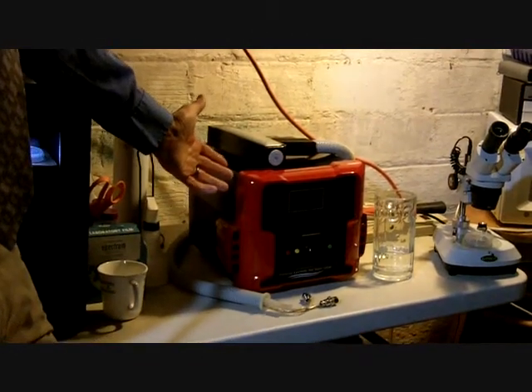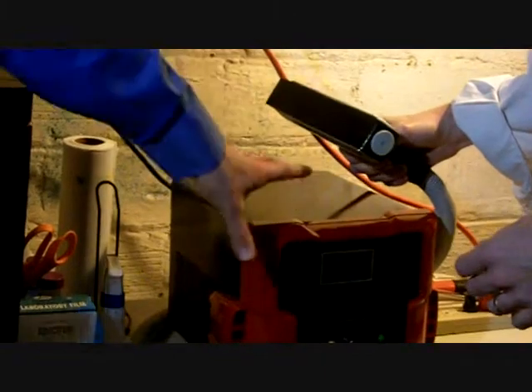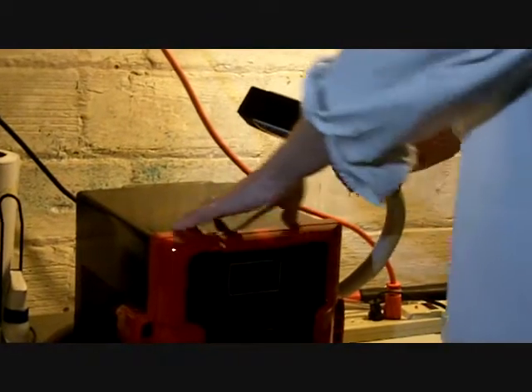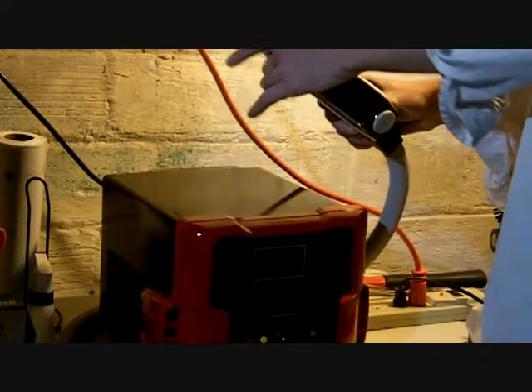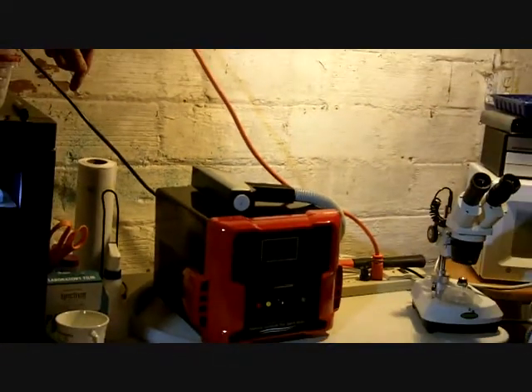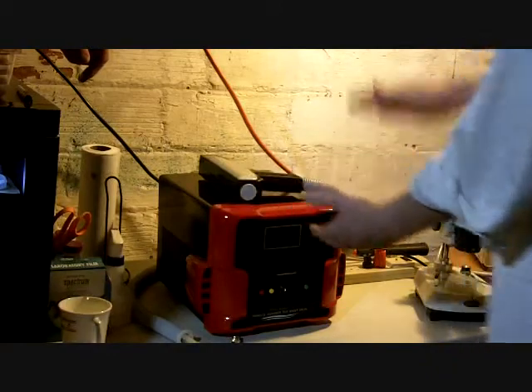And now we're taking a look at the laser that'll be used in the experiment. Can you explain the laser here? How it operates and how you're going to laser the worms? So this is the laser itself, really, all in this handpiece. And this is the power supply. It also contains a water pump. It's a typical setup for lasers. There's usually a head unit and then a remote unit that has the guts, basically. But the tricky part is all of the sensitive optics that are precisely aligned to get the beam just perfect are in here. So you don't want to drop the thing. Then you have to send it back to San Francisco and repair it for a couple hundred dollars, or use another one. And when you're going to laser the worms, you're going to have a structure such as a vise or a bracket, something height adjustable, because I have to be able to lock it in.